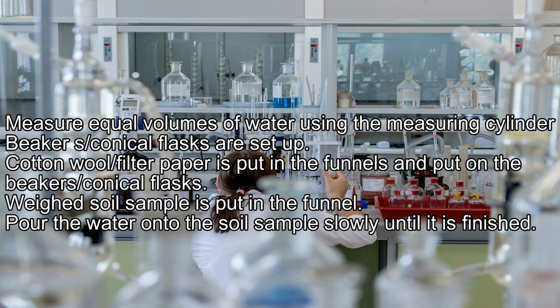Beakers/conical flasks are set up. Cotton wool/filter paper is put in the funnels and put on the beakers/conical flasks. The weighed soil sample is put in the funnel. Pour the water onto the soil sample slowly until it is finished.